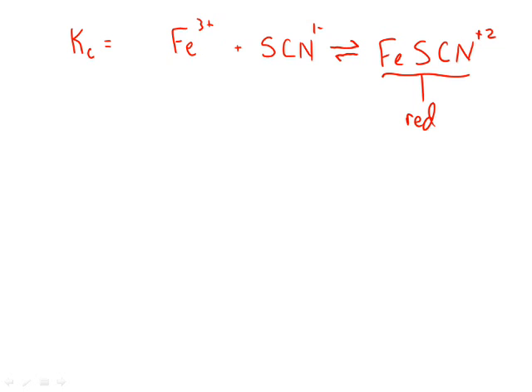So last week you prepared a series of concentrations where you mixed a lot of this, that was 0.2 molar in concentration, with this that was 0.002. Do I have the right number of zeros on both of those? Or was it something a little different?